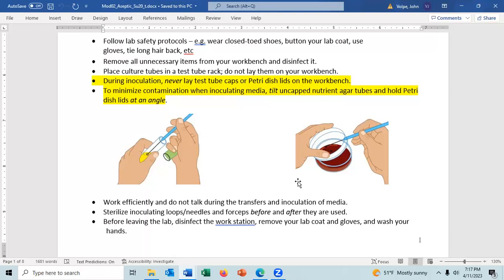The danger of doing this is if you put your hand over the upside down lid, then things will fall down from your hand, and they may fall down from the air. But if you did that briefly, like within 20 seconds, you'd probably be okay.